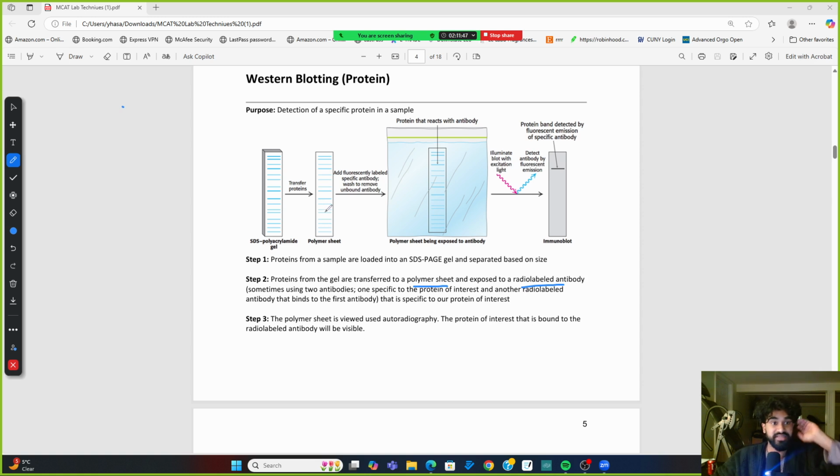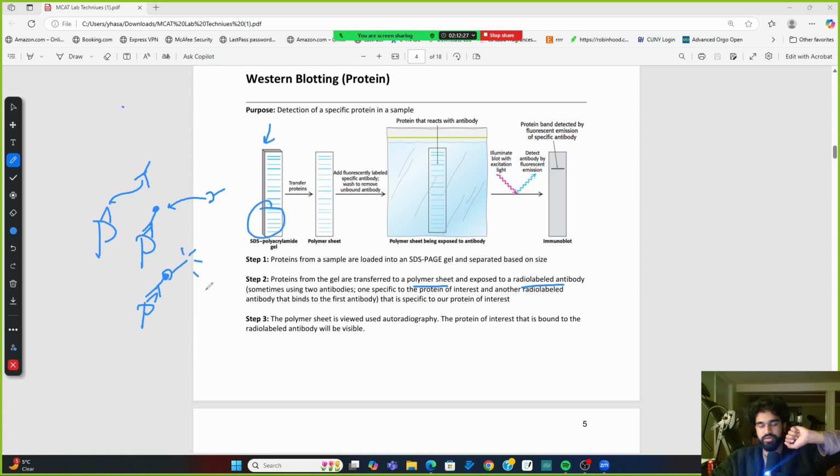Okay. Basically, you put some proteins on a gel. You want to identify a single one of them to see where it went. Here's the protein. It has an antigen on it. I take this antibody that binds that antigen, and it binds, right? Protein, antigen, antibody. Now the antibody doesn't glow by itself. I have another antibody that binds that antibody and glows. Protein, antigen, antibody, anti-antibody. And this thing glows, and it tells you exactly where the protein is.